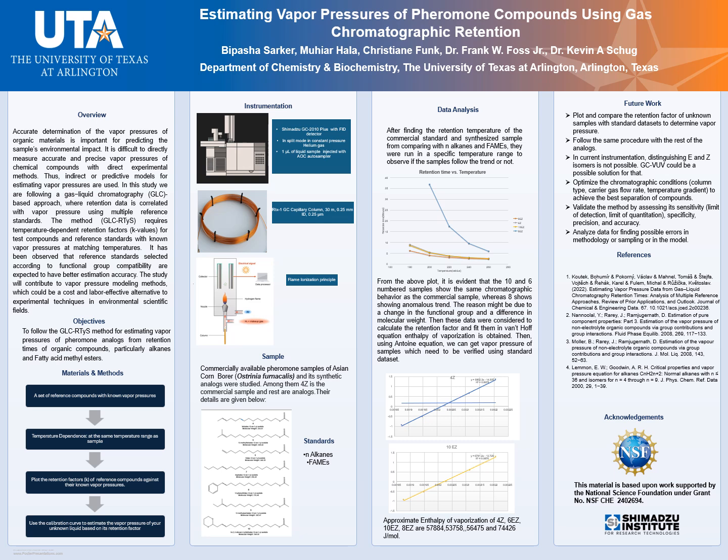So after finding the retention temperatures of the commercial standard and synthesized analogs of this pheromone, we have compared them with alkane retention times and FAMEs, so that we can at least get accurate retention times.